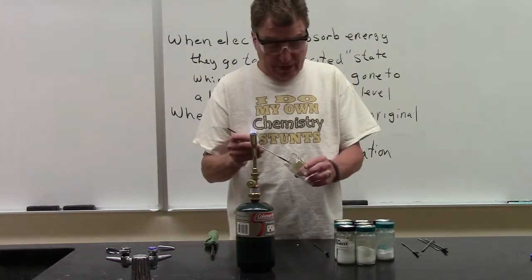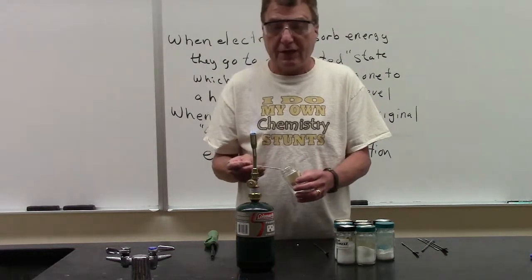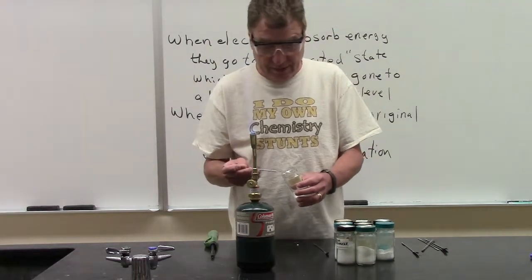Barium. Barium chloride. There's a really bad joke about barium. What do you do with old dead chemists? You bury them. All right?